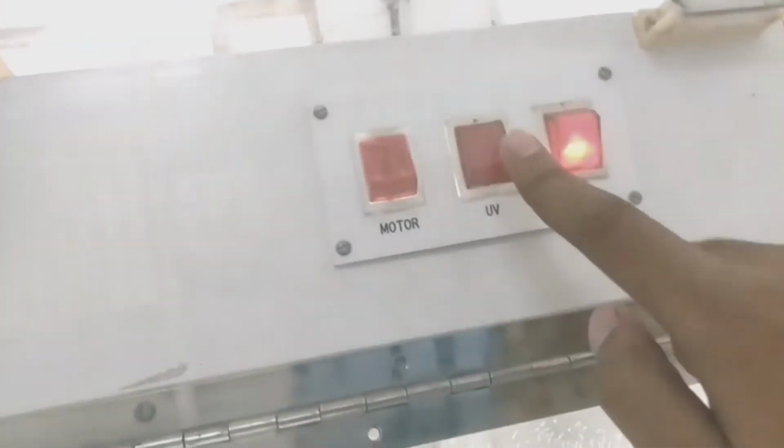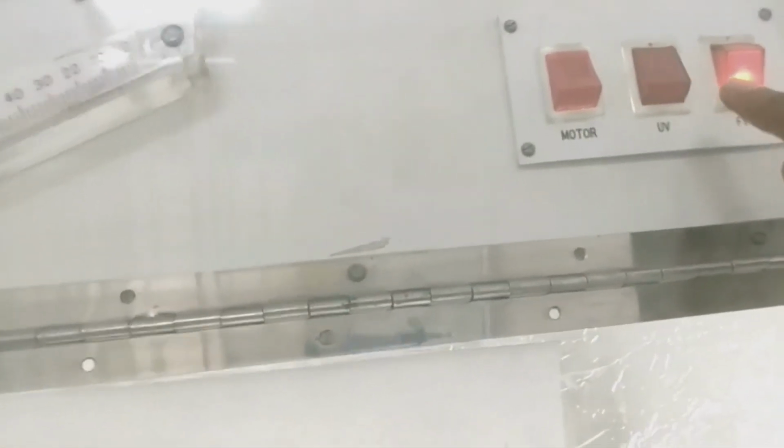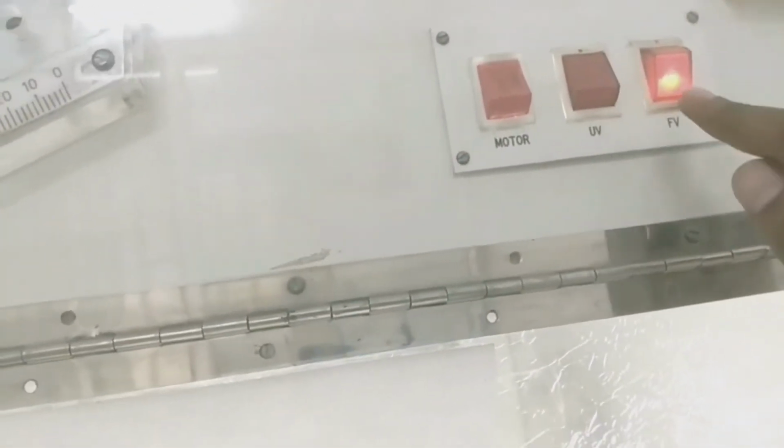Second is the UV light. When we are going to work on laminar airflow, firstly we have to switch on the UV light for half an hour or approximately 1 hour, so that all the contamination on the surface in this chamber will be killed by the UV light. And this is FV. FV, as you can see, is the fluorescent light, which is white in color. So that's a normal thing for doing the work. Here it also contains a Bunsen burner.